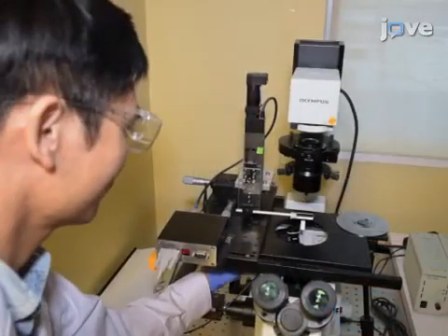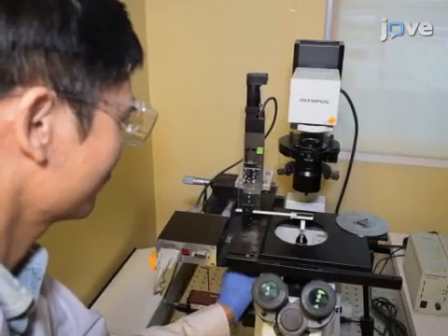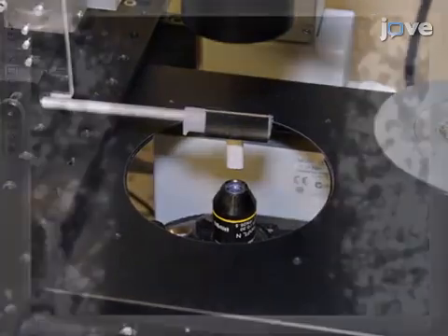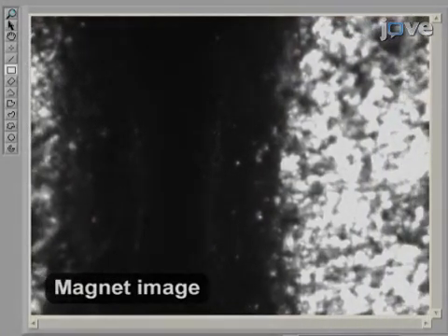Next, align the magnet's centers before mounting the channel. Use a 10x objective lens to adjust the X and Y axis of the magnets in the optical axis of the microscope, using a computer-controlled motorized machine.